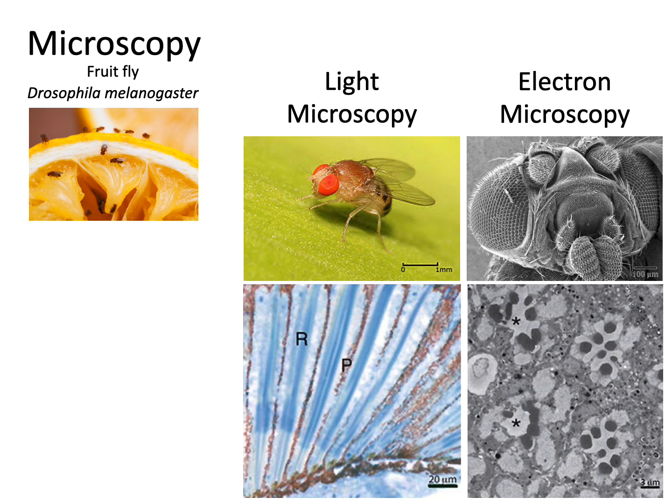So maybe you'll use a stain that'll stick to lipids, and that stain is very electron dense, some sort of a metal that's sticking to those regions. That'll make it harder for electrons to get through with the technique and make those areas look darker as less electrons pass through. We'll talk a little more about that. Okay, so light microscopy compared to electron microscopy.